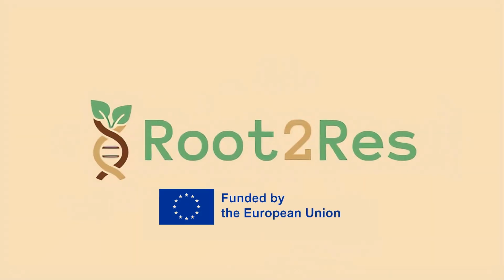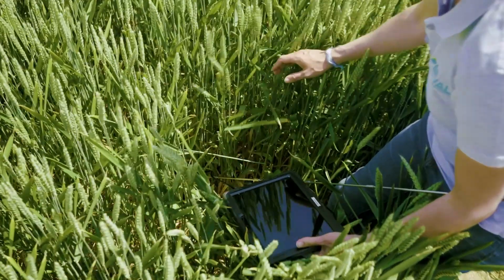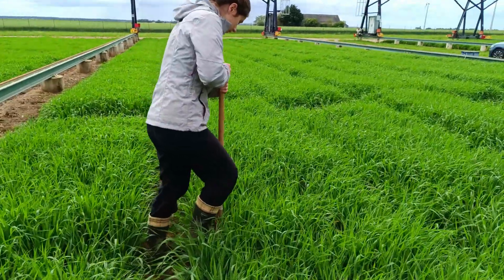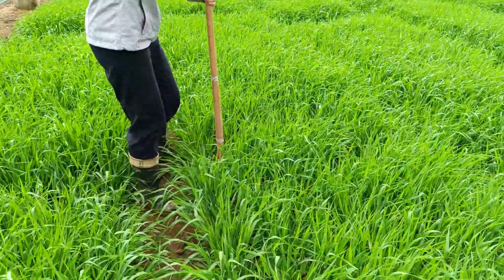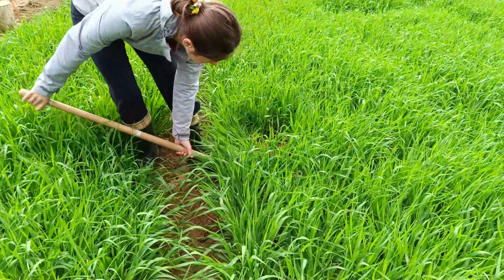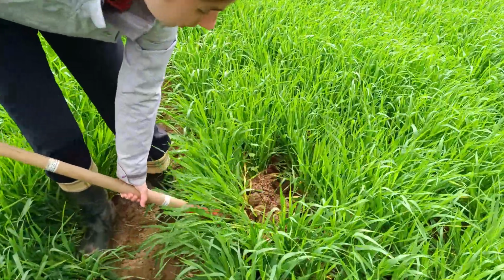As part of the Root 2 RES project, funded by the European Union, we are evaluating different techniques for characterizing plant root systems. Shovelomic sampling is the most widespread technique. It allows access to plant root systems directly in the field using only a shovel.